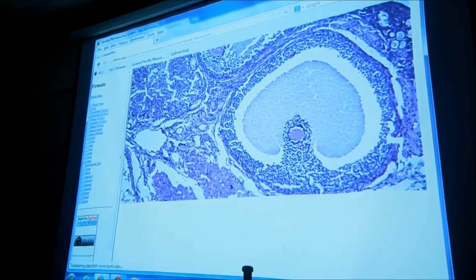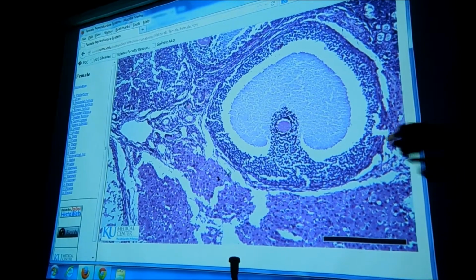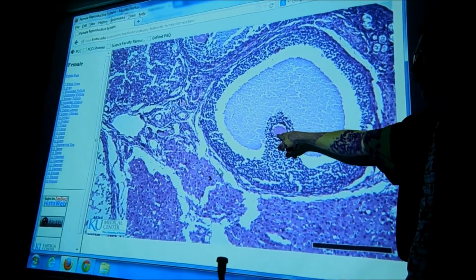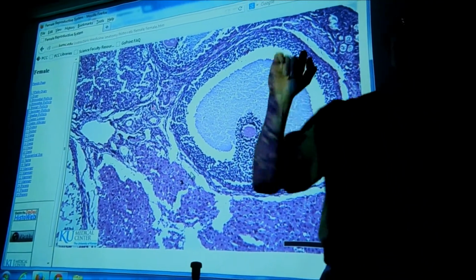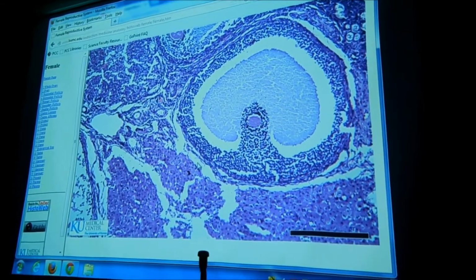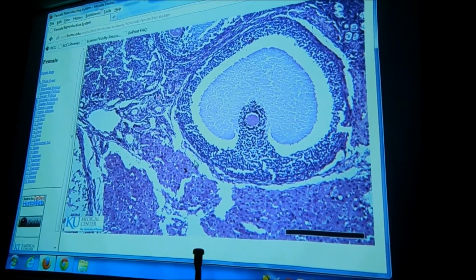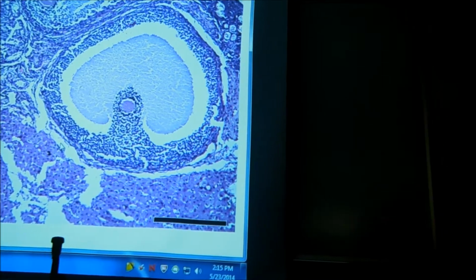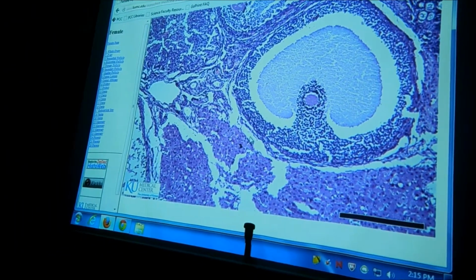So then our last one, my favorite, the one that's full of fluid with the egg on the side. So this follicle is mature, a Graafian vesicle. That egg is secondary. Here's some little primordials over here. Right. So you're going to have to name the cells and the egg separately in your head as you go up the chain. Make sense? Is there a picture that has all of them compared to each other? On the poster. Okay. So the poster is going to be your friend.